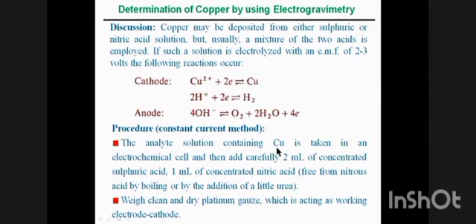This is an incomplete part of the procedure. This procedure uses the constant current electrolysis method, which is a type of electrogravimetry.